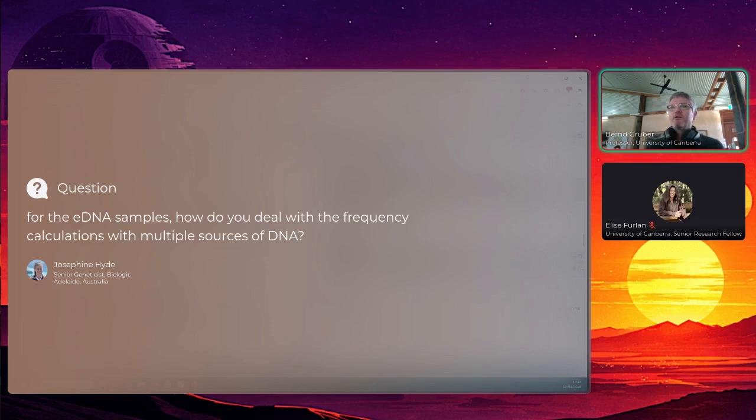Okay, cool. So from our GL select panel function, we got what we wanted. We got 50 SNPs. Sorry.